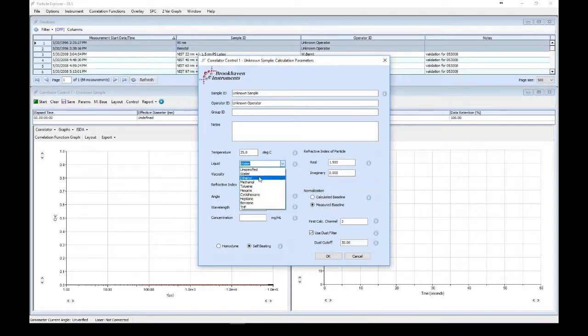If your diluent is not on the preloaded list, you may enter your own by selecting Unspecified, and you can type in your diluent. In this case, you will need to provide the viscosity and refractive index of your diluent at the temperature and wavelength you are measuring at.